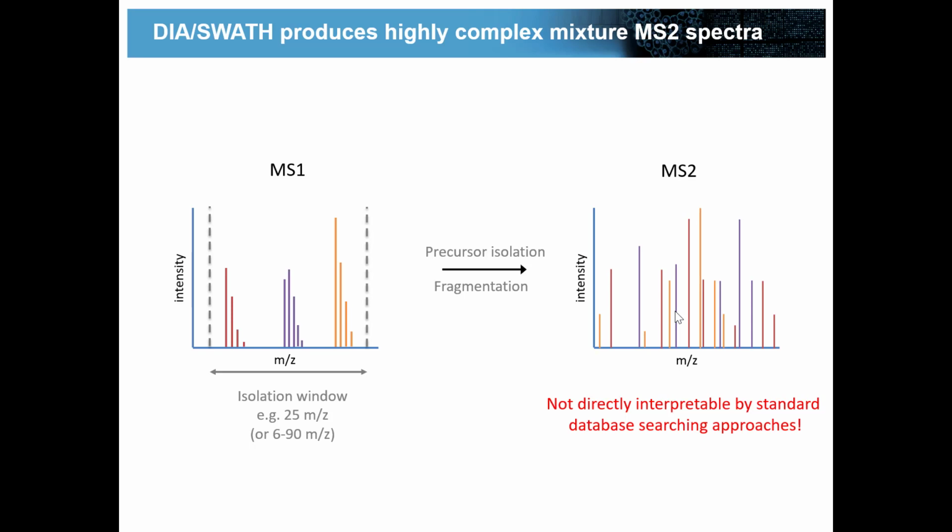What are the peaks that are exactly in that window? On the border? Yeah, so what we do in that case is we put a little overlap, so it'll be full in either one or the other completely. That's the way we've handled this. This costs you a little bit of extra cycle, essentially, but that's a good way to do this. We always measure monoisotopic peaks too, so the whole isotope distribution still would get mangled on those edges, but we're always looking at monoisotopic fragment ions.